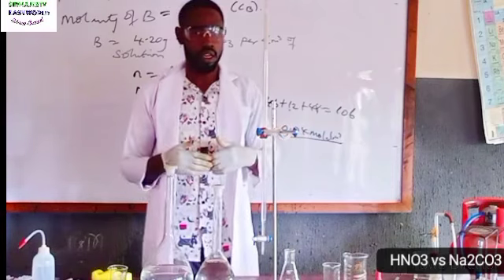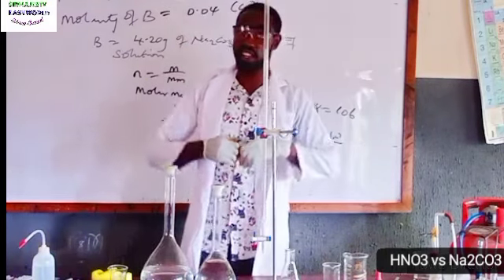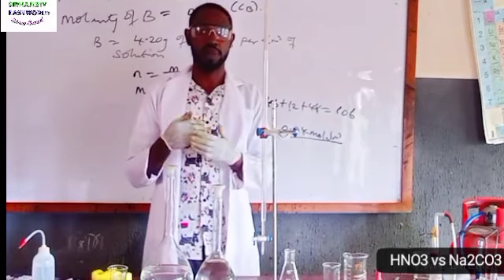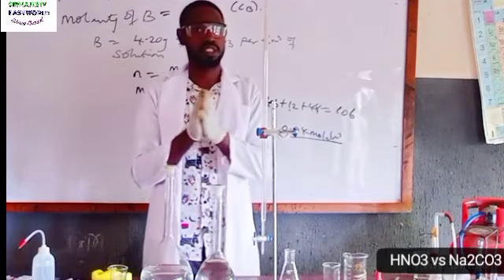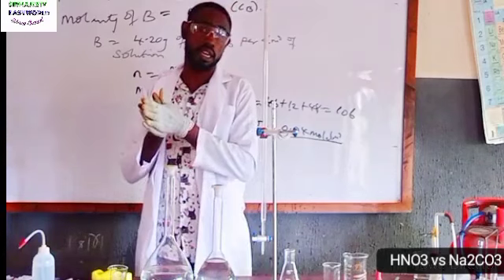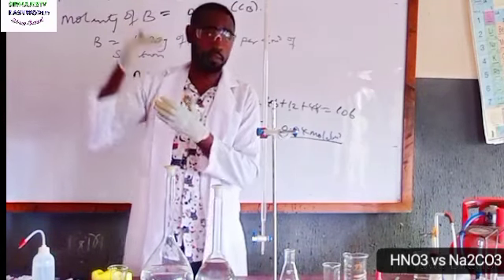In this case, anything can be your endpoint. But I did mine using 70%. So if you are using 65%, you won't get the same endpoint with me. Your endpoint will be higher than mine.